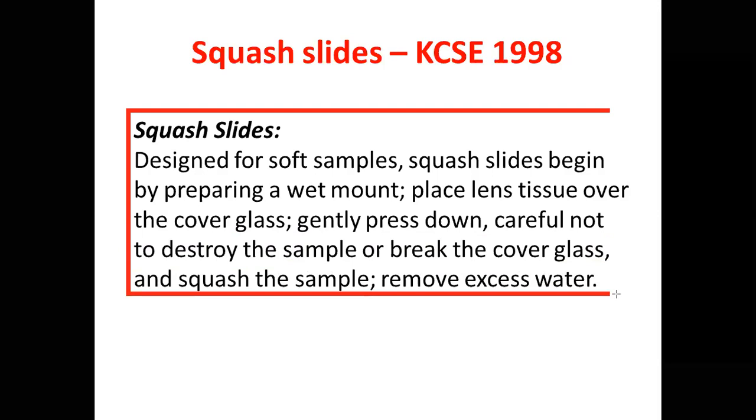It can easily break. And as we do so, we squish. We want to be in a position whereby we are pressing, but we are not destroying. Because if you press hard, like with the pollen grains that we wanted to observe in 1998, they would easily break and we would not observe them. And when they say gentle, it must be gentle.